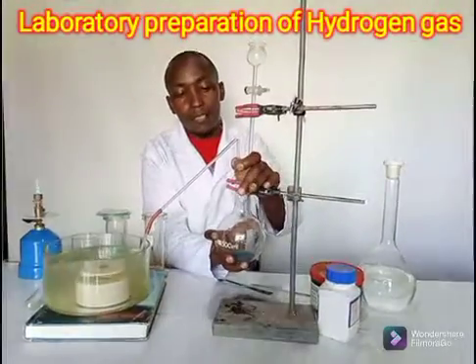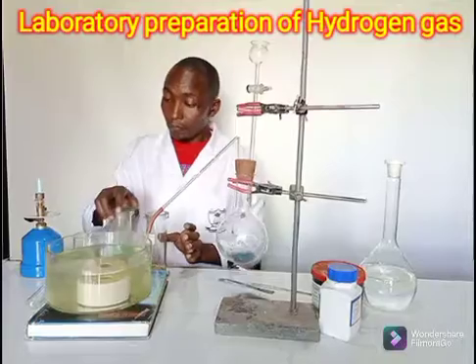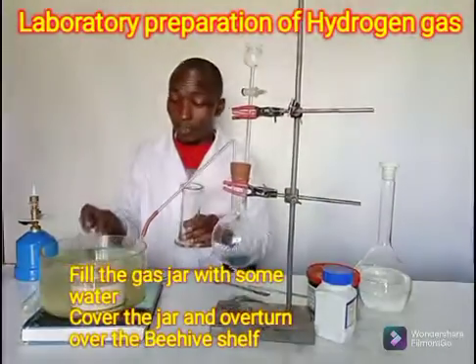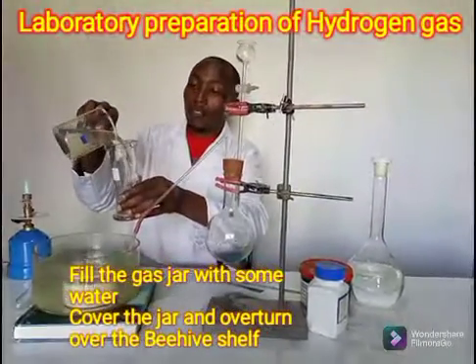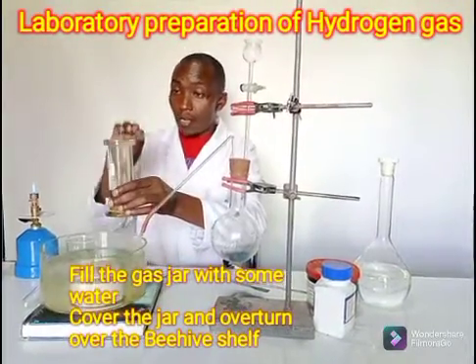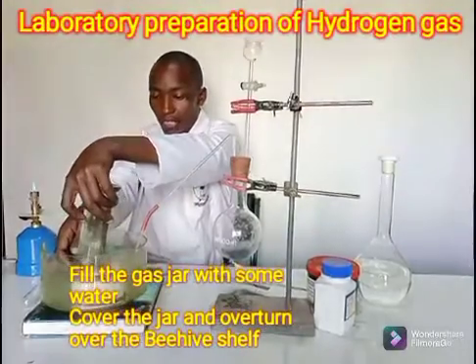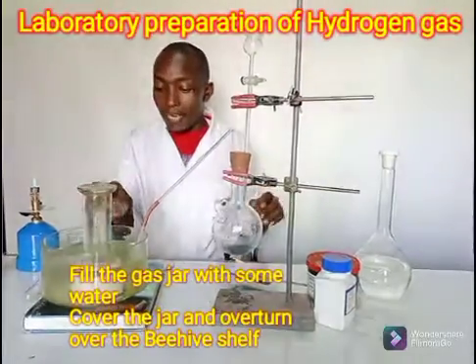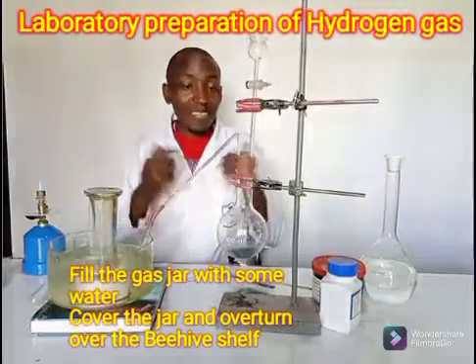Then I will place back the setup. I'm going to fill the gas jar with some water and have it filled up. Then I close it just to help me overturn it, and let it be supported by the beehive shelf. And I'm ready to go.